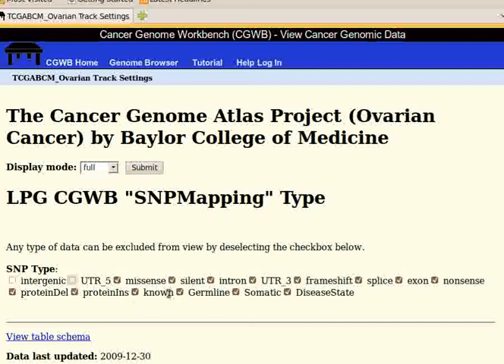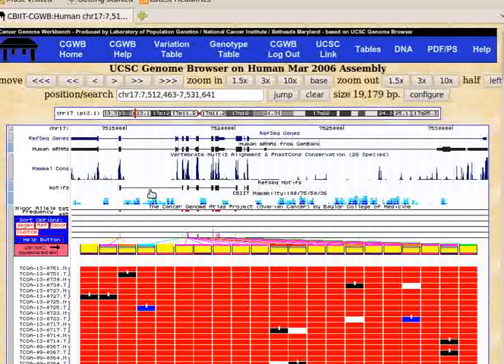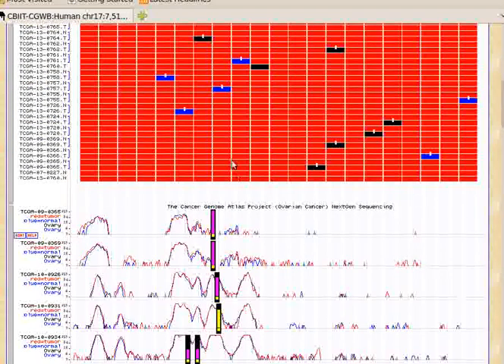You can pre-select or deselect everything that's intronic or UTRs, and only allow display of somatic mutations, but not all the other types. Submit, and it will give you a full view where you can observe how many samples by Sanger sequencing have them. It almost looks like all samples have somatic mutations in P53.